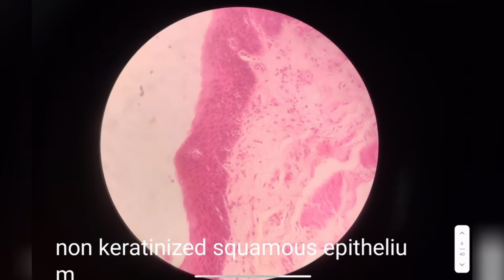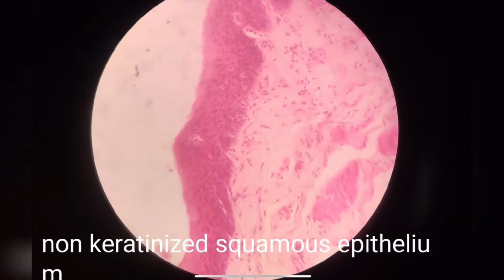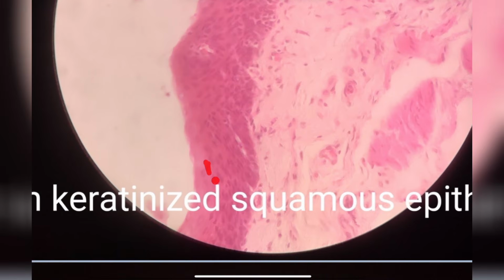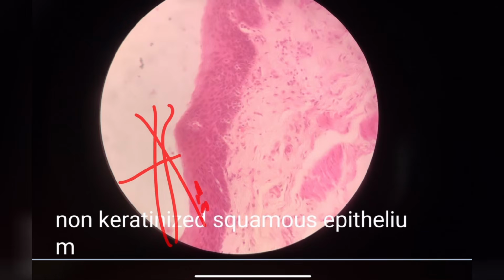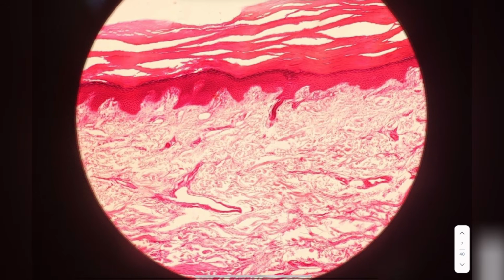Next, you can find that there are multiple nucleus arranged in multiple layers, and the nucleus at the topmost level are flat, and there is no deposition of keratin. So this is non-keratinized stratified squamous epithelium. Next, there are these flat cells at the top, and there are cells arranged in multiple layers.